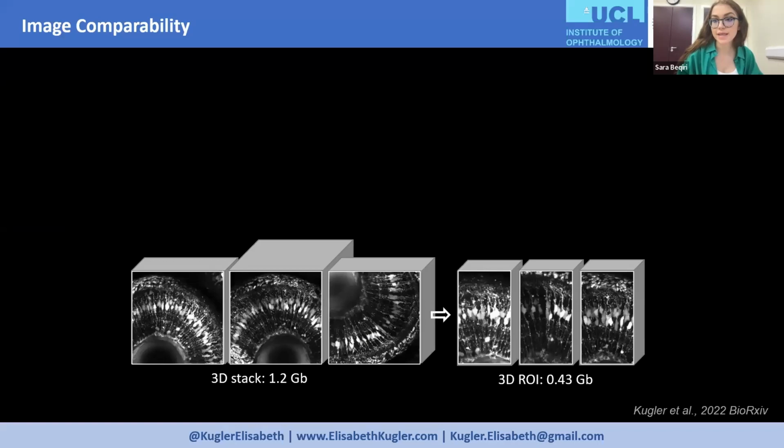So this bit is about image comparability. Now that we have an understanding of our image and we can see what it should be saved like correctly with the correct proportions, we can now proceed with the next step of analysis. Whole mount zebrafish imaging, just like many other biomedical models, requires sample embedding. However, there are no hard set lab standards on sample orientation. As you can see here, there are 3 different alignments for the first 3 images. They're aligned in different directions. They're not all the same. And this variability in position can affect our data.